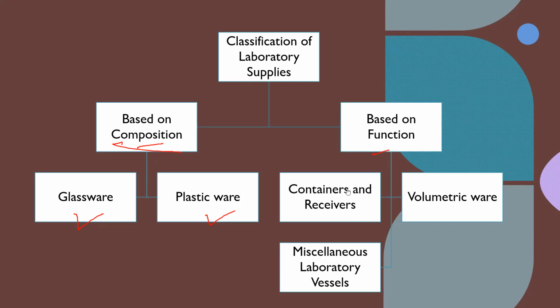As we all know, this might cause damage or laboratory-related injuries to laboratory personnel, or to you as a medical technology student, if you use plasticware for strong acids.